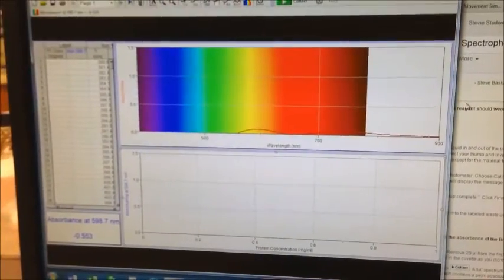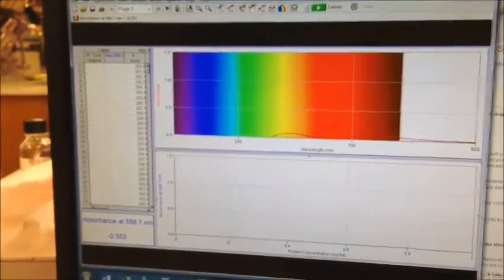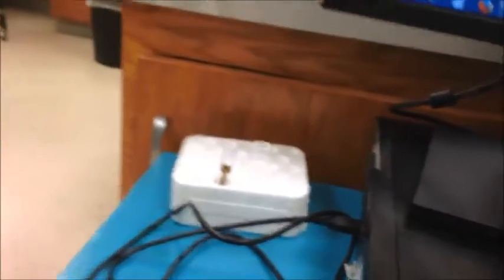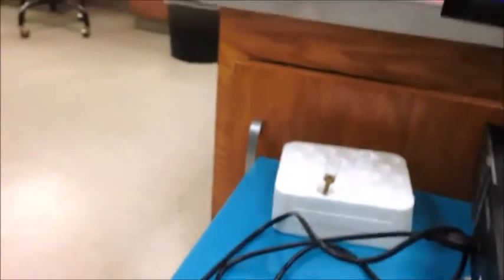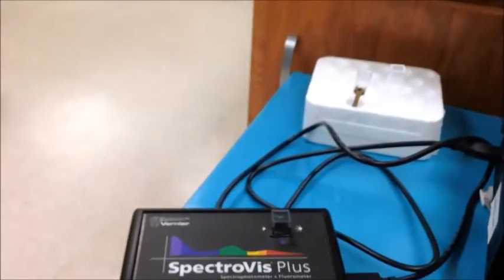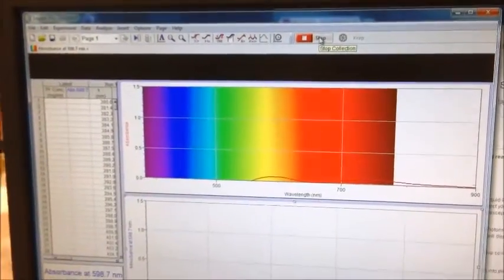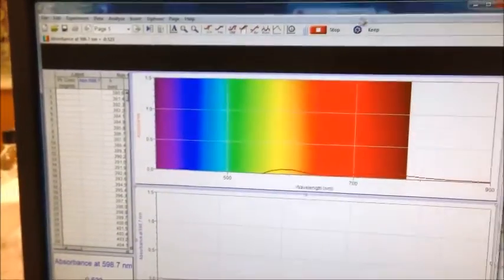So I've set up the spectrophotometer, calibrated it, it's all ready to go, I'm ready to collect data. Let's collect some data. So here's my sample, Coomassie, I'm sorry, Bradford reagent with milk. Let's tell it to collect data. Alright, it's collected data. I'm going to tell it to keep in.